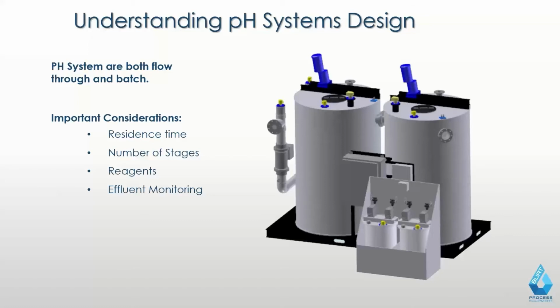It depends. In a lot of cases, if you have the equipment and the drum handling capabilities, having a drum is good, but you have to remember that no matter which way you do it, you are handling chemicals. If you're pumping it into a reagent tank, you have a pump down that has to go in and draw out. If you're changing out drums, you're pulling out suction wands that have been immersed in the chemical and putting them into a new one. Me personally, I like to have onboard tanks because it's easier to have a fixed system where you're not touching the metering pumps or any of that equipment. You're simply opening up a fill cap and filling them.